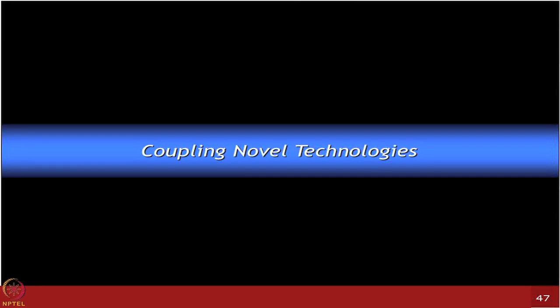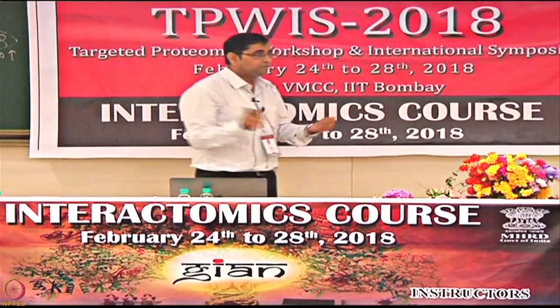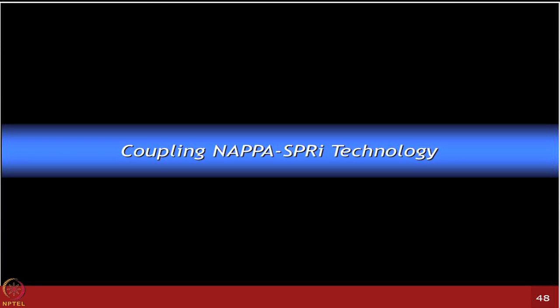Alright, so over the period, what you would have realized from the various lectures given by Josh is that there is so much need for integration of new technologies and development of new technologies, and that's where coupling different existing platforms becomes very crucial. In Josh's lab, we thought a couple of years ago, and many people are still working on developing those technologies, of coupling NAPPA technology with SPR imaging based platforms.